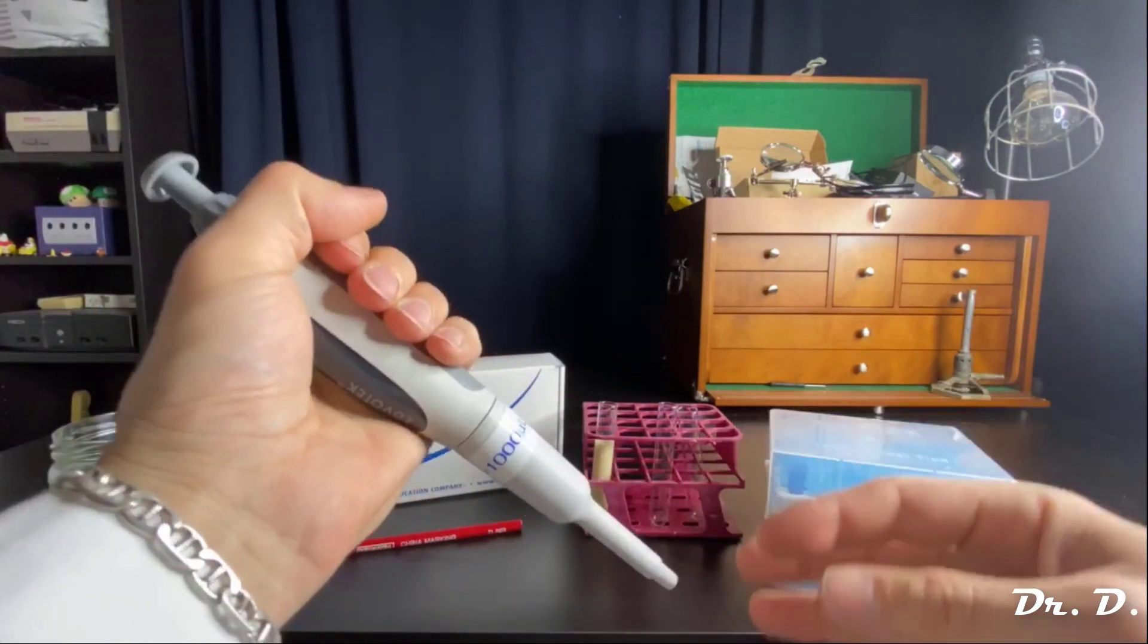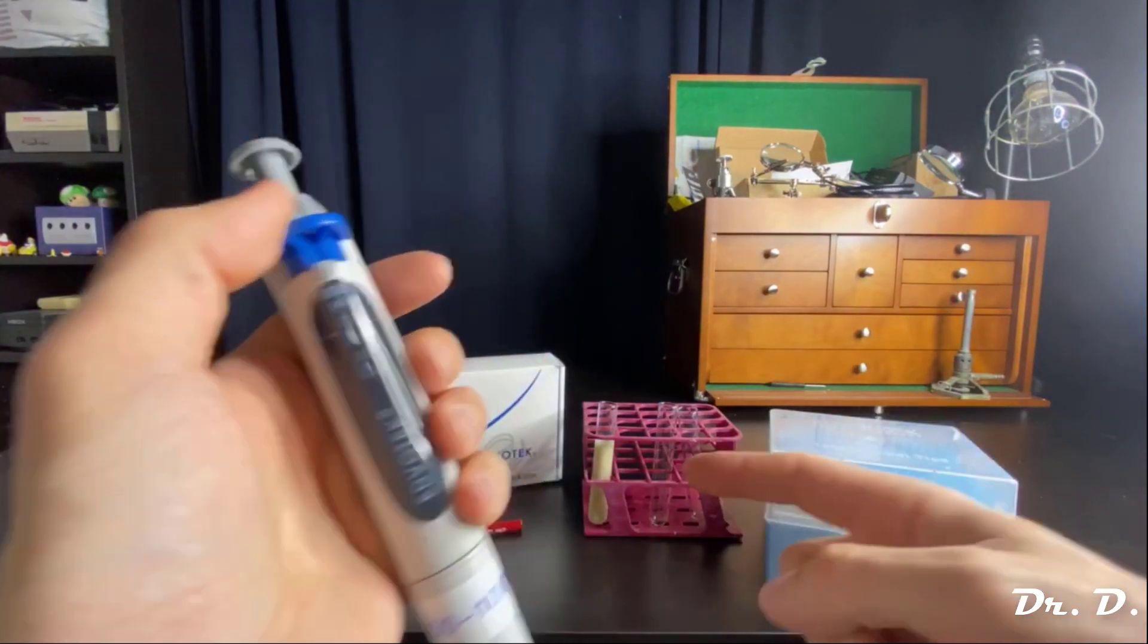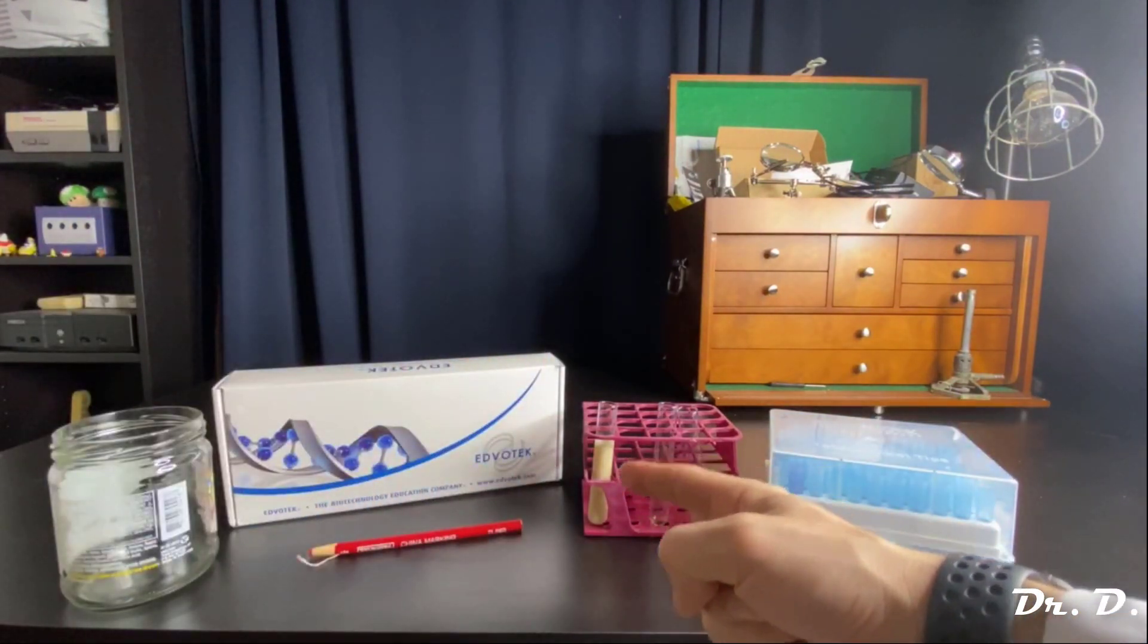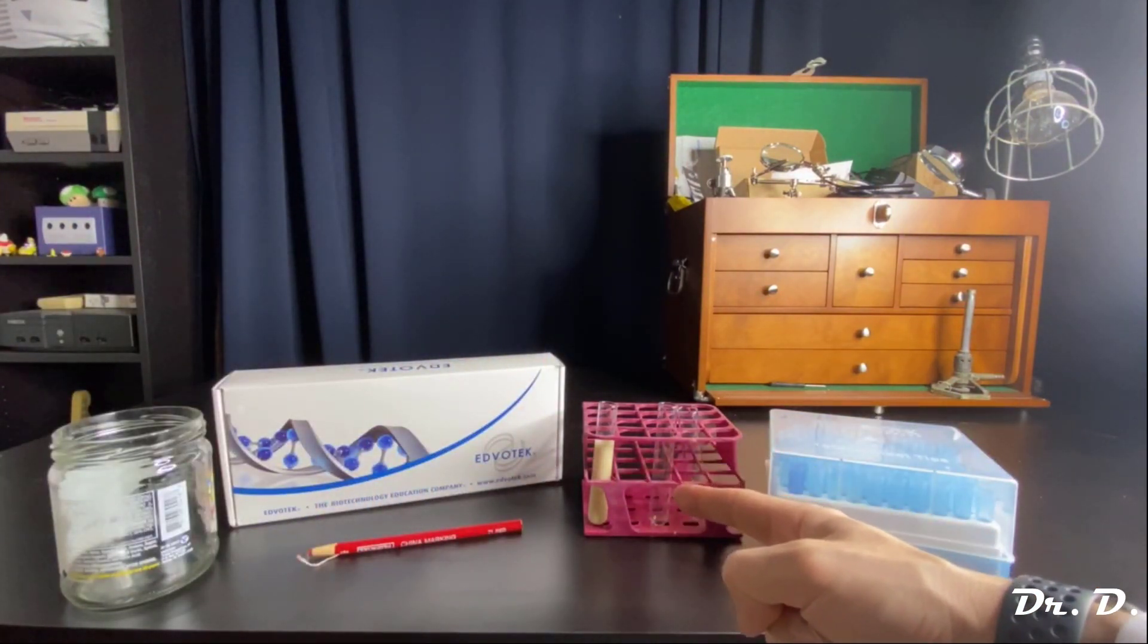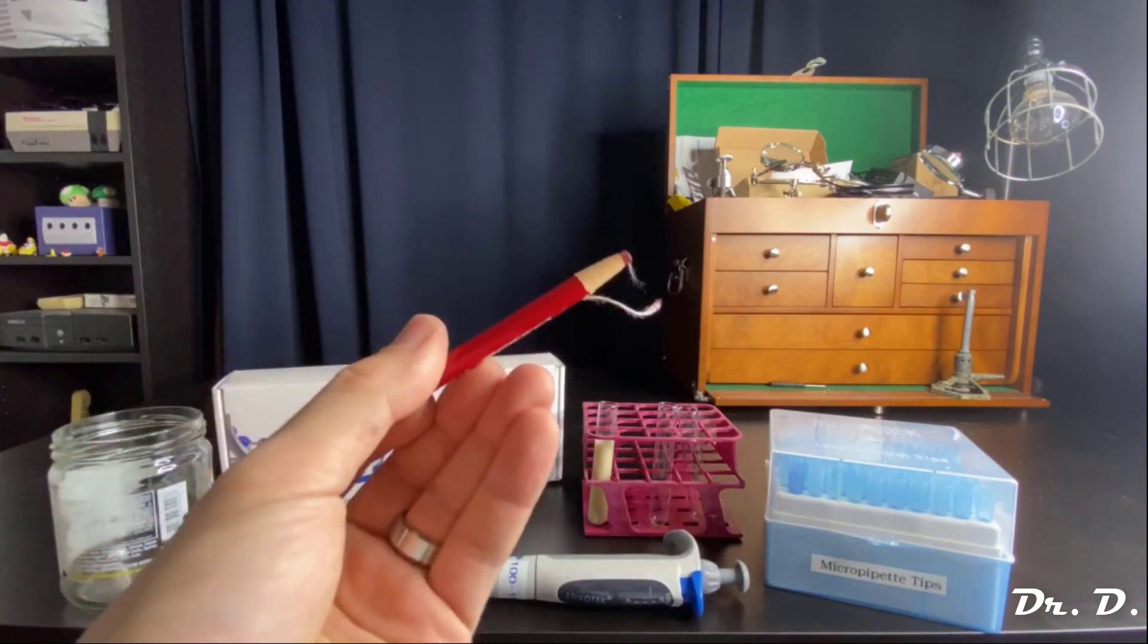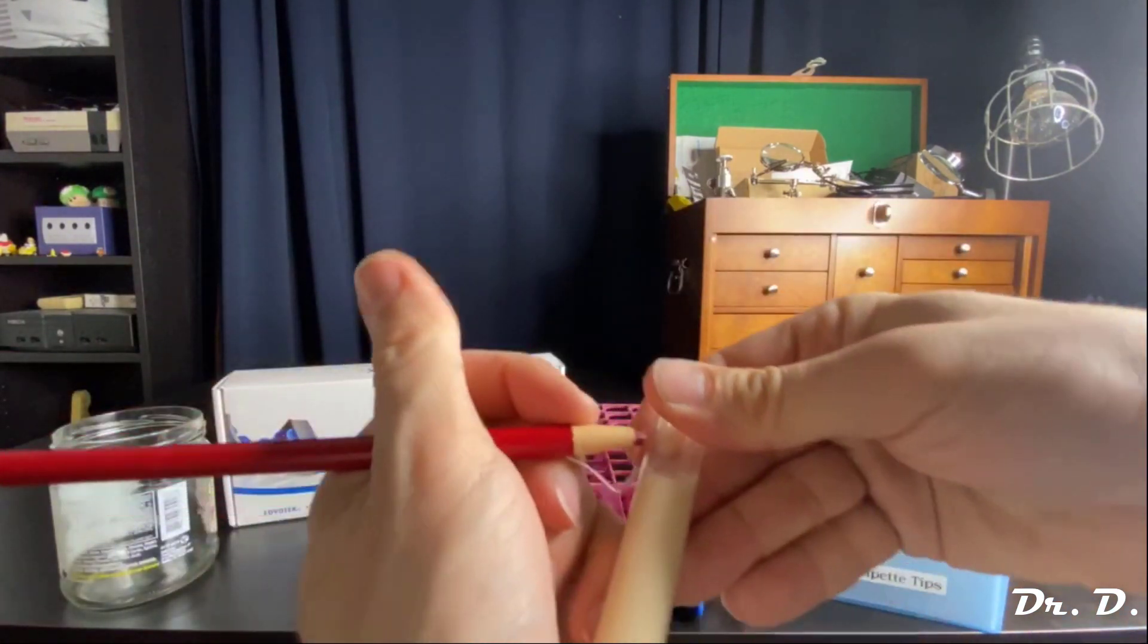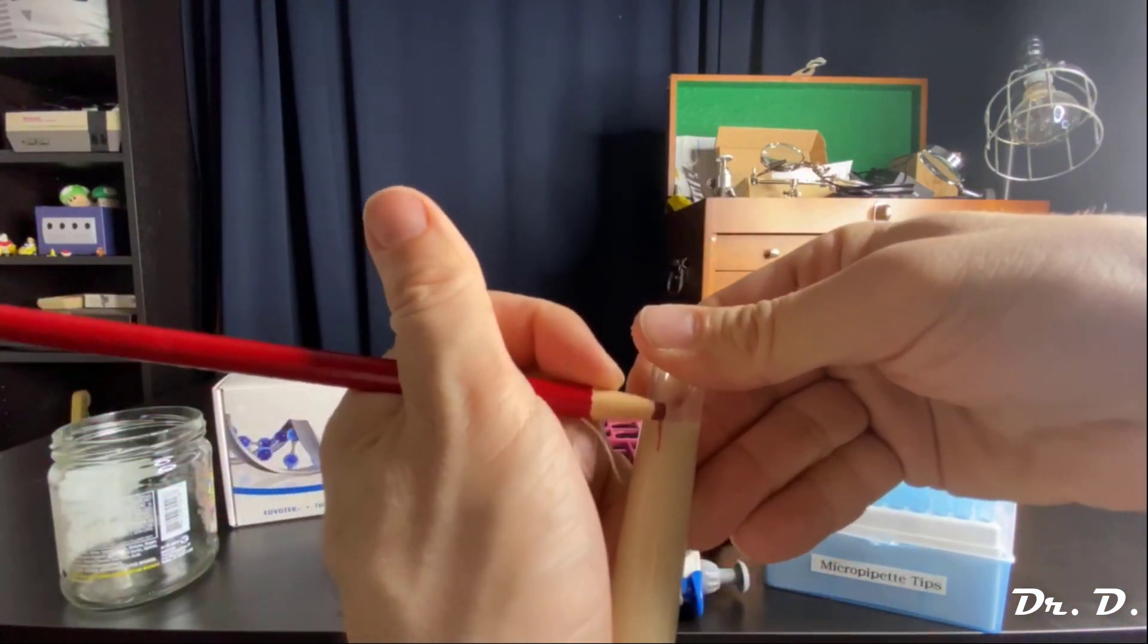Let me show you how to actually aliquot. Let's say I want to aliquot 500 microliters of this solution into another test tube. Don't forget, you can use china markers, which are essentially wax pencils, in order to write on test tubes.